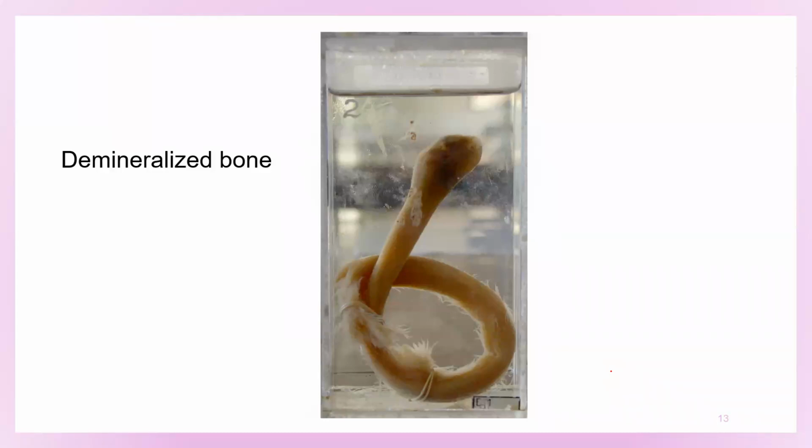That shows you that the hardness in the bone is given by the calcium salts in the matrix. The proteinaceous substances, cells and all that, do not have that, so a bone can even be tied in a knot when you remove the calcium from it. This specimen is there in the lab. You can see it when you come.